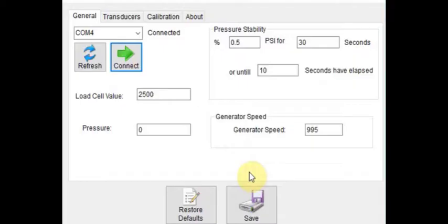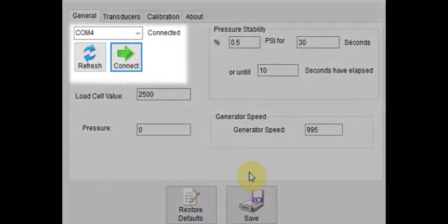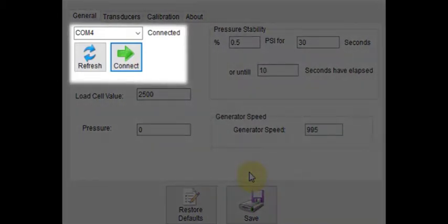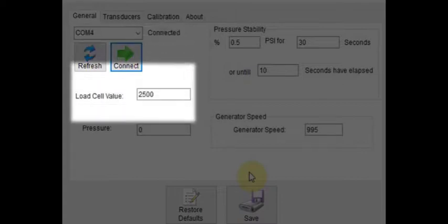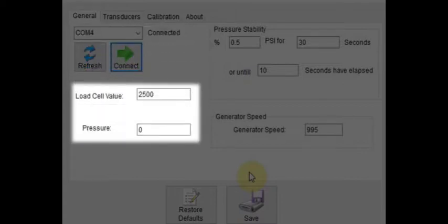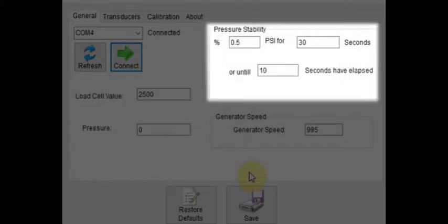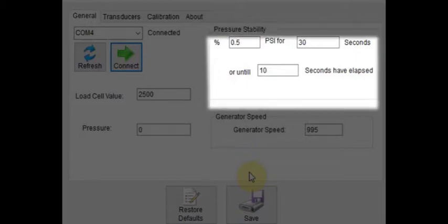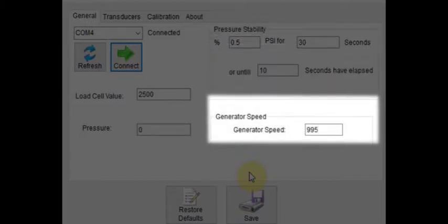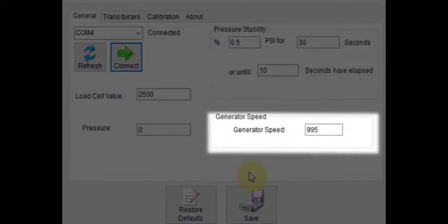In the settings menu we can find various parameters to configure for an auto-test. In the top left section, we can configure the communication port that will provide communication between the software and the machine. Below this we can set a load cell value as well as the pressure. In the top right section of the menu we can set pressure stability parameters. Here we can dictate the percent movement in PSI for a duration that will deem the pressure stabilized. Below this we can set the generator speed.